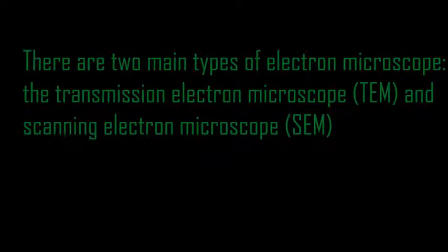Now, what are the types of electron microscope? One is the transmission electron microscope. Two, the scanning electron microscope. Now, let's try to describe each type of electron microscope. One, transmission electron microscope.